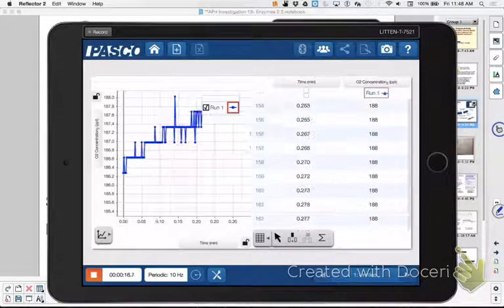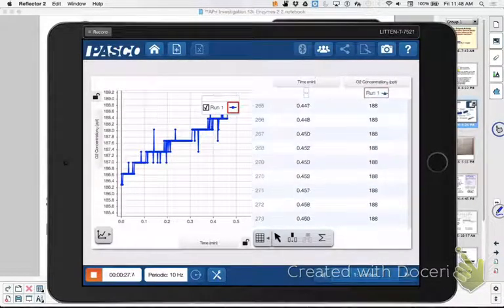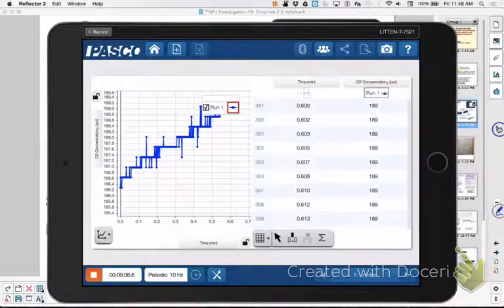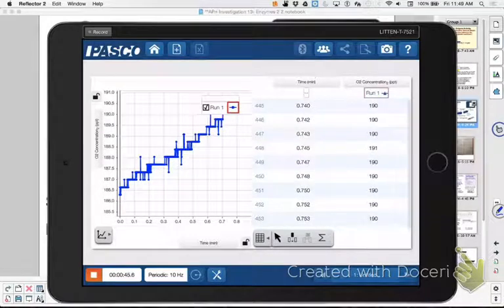Now, I'm not going to run it for all 3 minutes right here because I want to show you something else. I'm going to take 2. I'm taking yours right now. And I'm going to put in not as much enzyme or not as much substrate while that's running. H2O2, I'm double checking. 2.5. I didn't rinse this out, so that's risky. I'm just doing it for a demo.